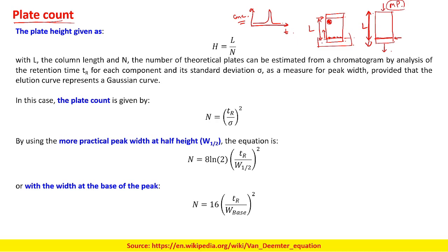However, if you change the parameters, you can get a fine point here, and in the column, you can get a very sharp peak.